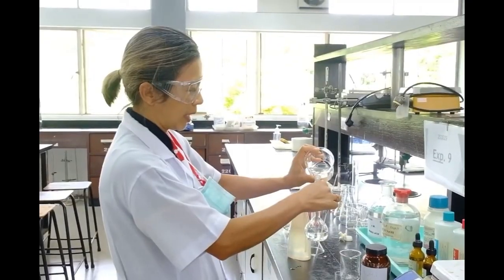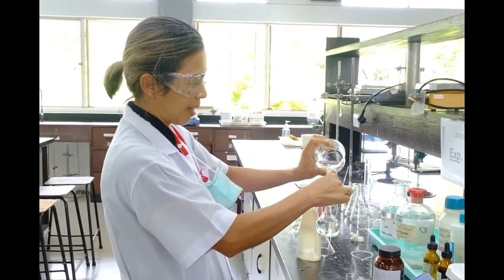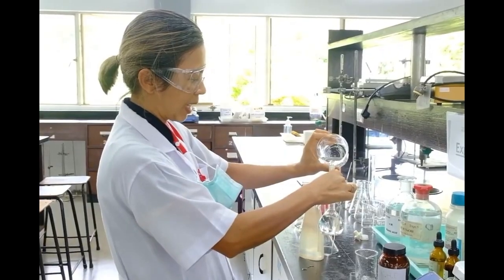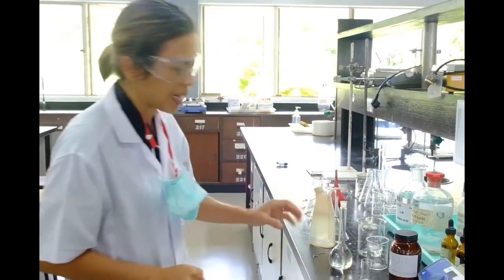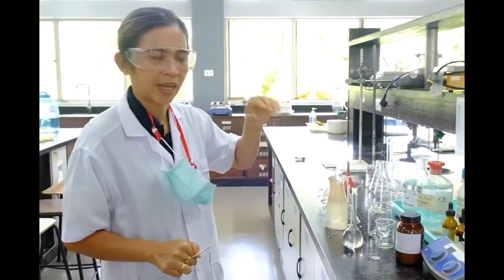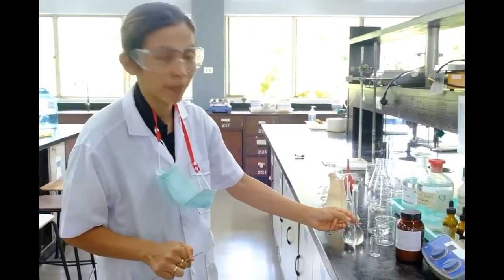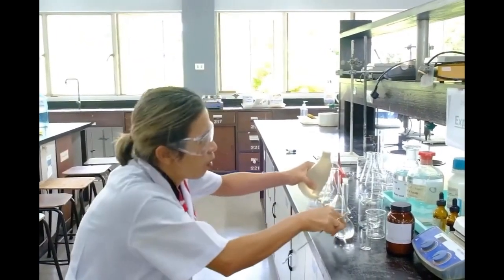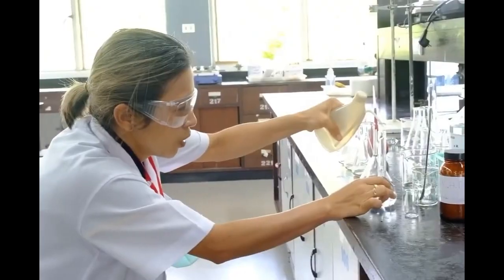Then, pour distilled water into the volumetric flask to adjust the volume of the solution. When adjusting the volume, ensure your eye level is at the volume mark. On the 100 milliliter volumetric flask, observe the lower curve of the meniscus.